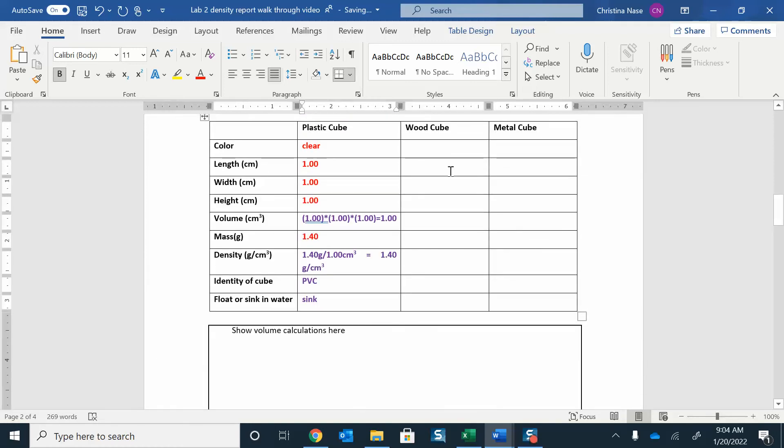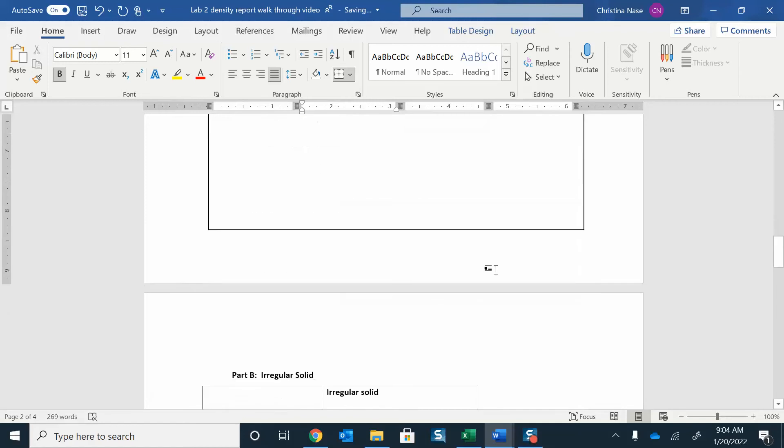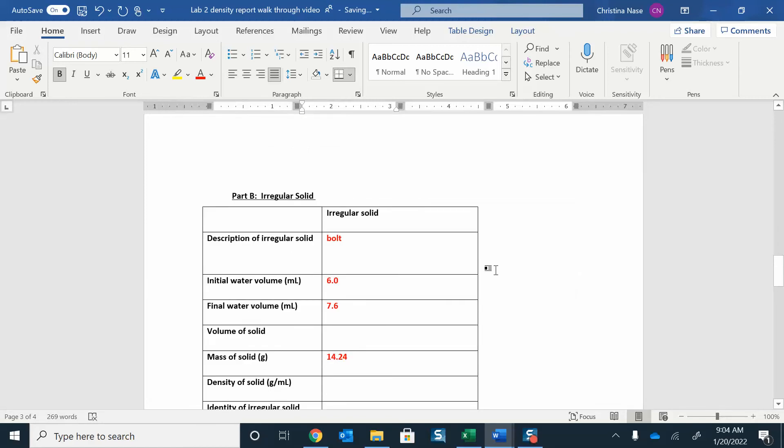You do the same process. You're going to measure the length, the width, the height. That will give you the volume, and then mass over volume will give the density. Then just identify the cube and indicate whether or not it's going to float or sink.